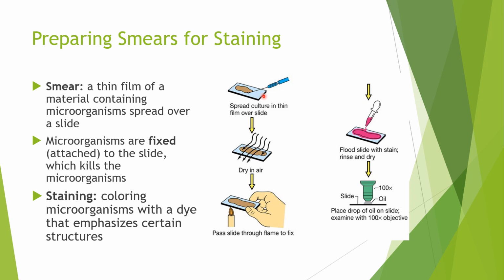So if I want to create a bacteria smear, then I'm going to take a sample of my bacteria and spread it on my slide. And you don't want too much of your specimen, because the thinner that film on your slide, the better.